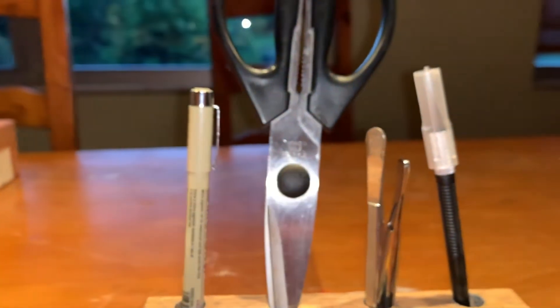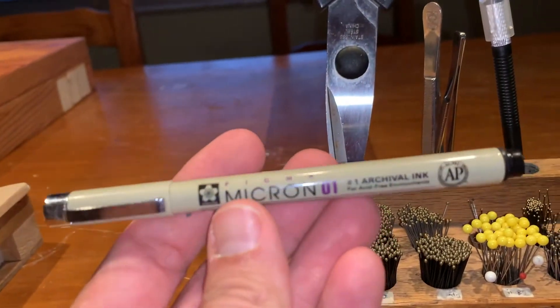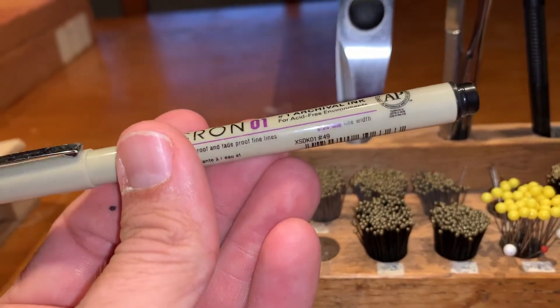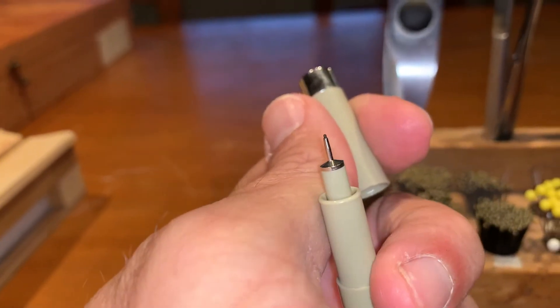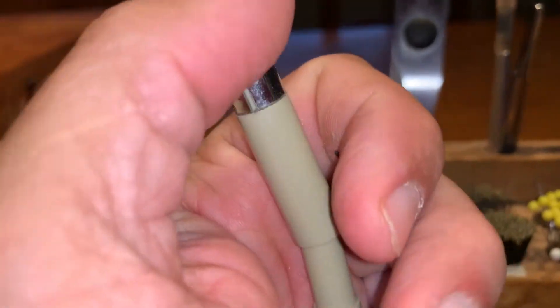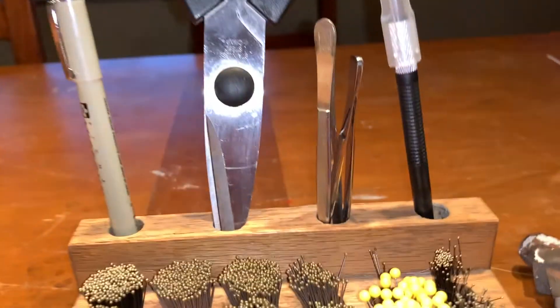We have a Micron pen, which is archival ink. We use archival ink and a pretty thin diameter Micron pen. When we're writing our labels and we want them to last, we use archival ink because it doesn't fade very easily — it'll stay nice and dark for a long, long time. We've got a pair of scissors, which we'll need.